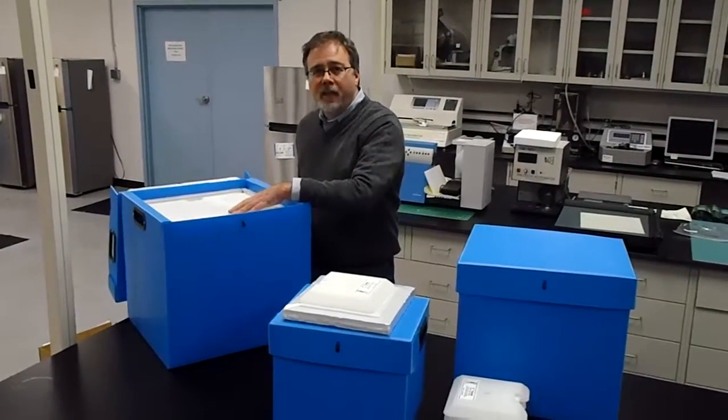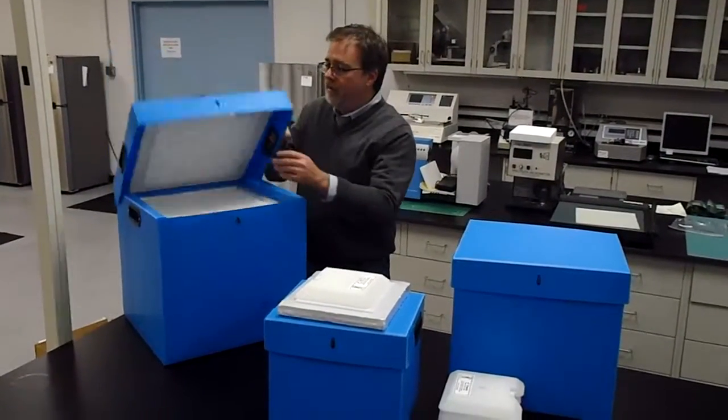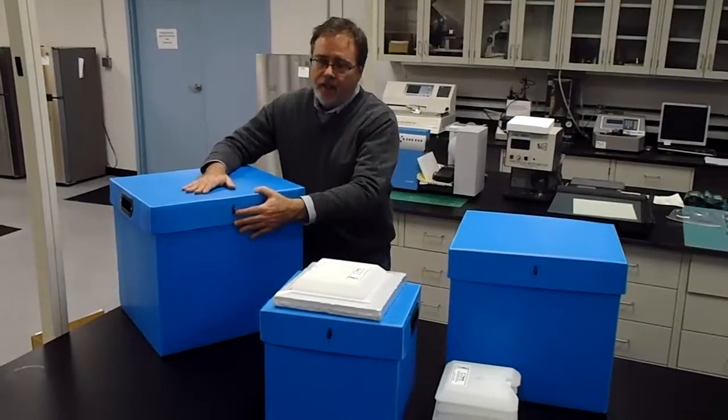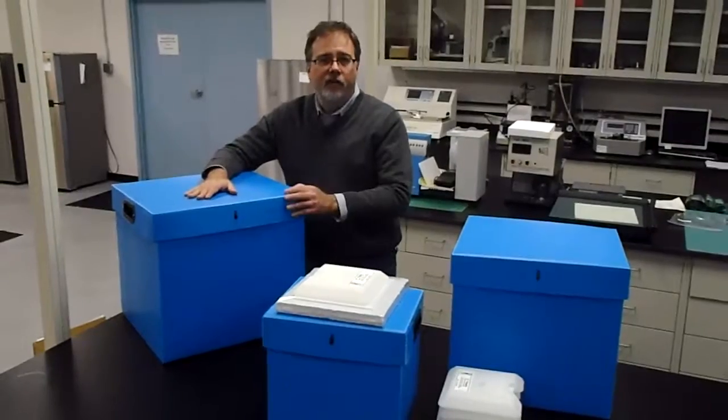After everything has been packed, the lid is already pre-installed on the outer shipper. Simply close it, secure it — an optional lockout/tagout is available on the shipper — and it's good to go.